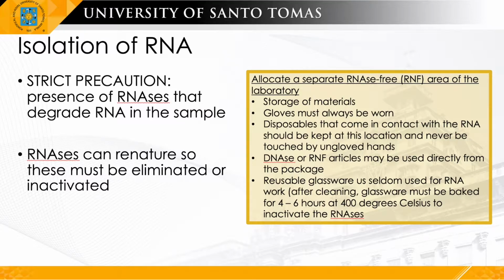RNase-free articles may be used directly from their packages, and reusable glassware is seldom used for RNA work. No? After cleaning, glassware must be baked for 4 to 6 hours at 400 degrees Celsius to inactivate these RNases. Okay?